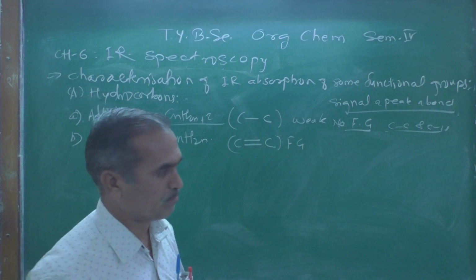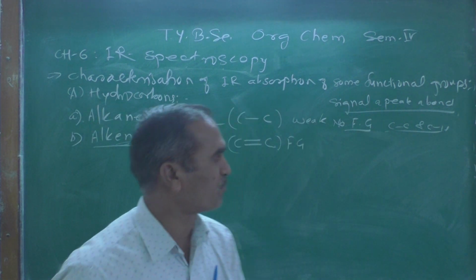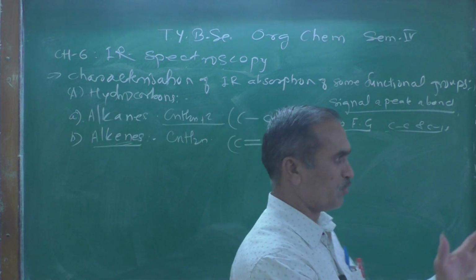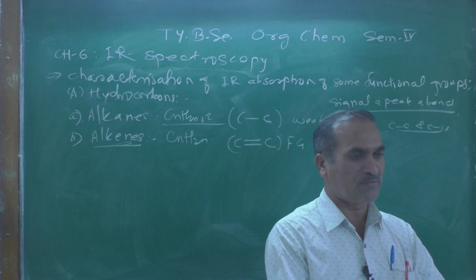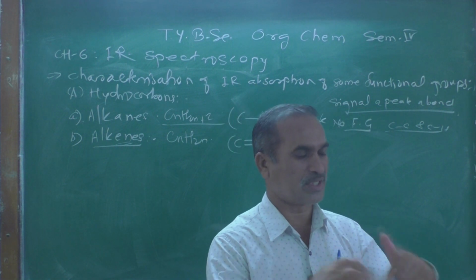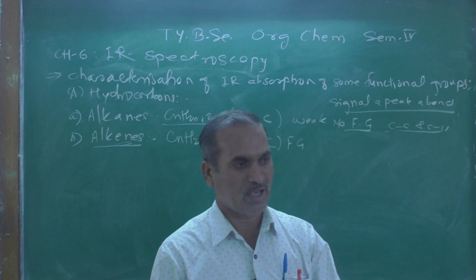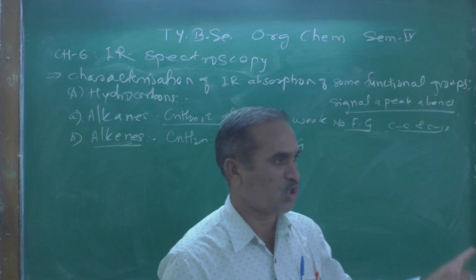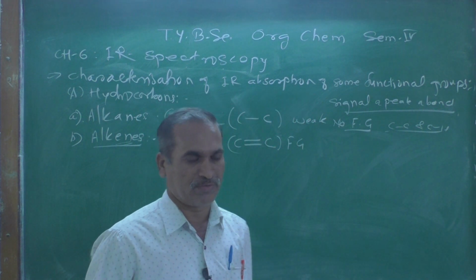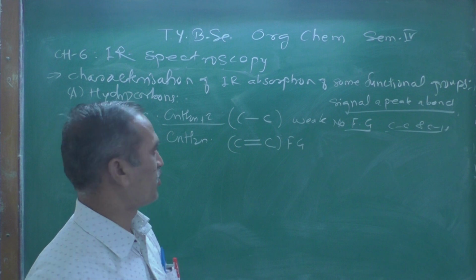Every organic compound shows these peaks, and therefore they are not useful for the interpretation of IR spectra from an organic chemist's point of view.